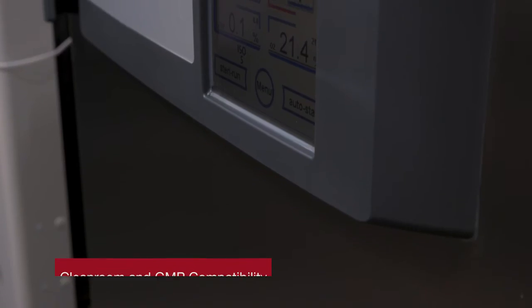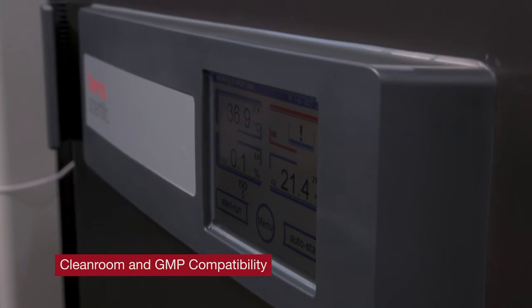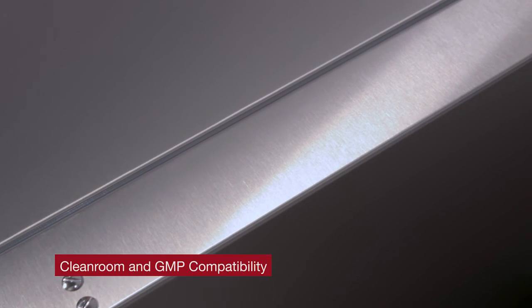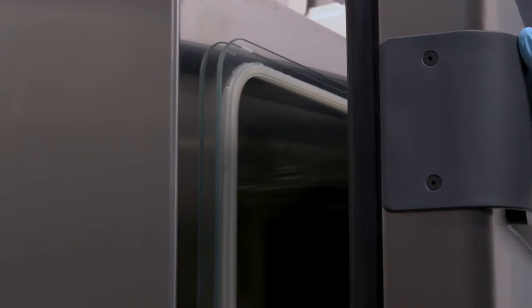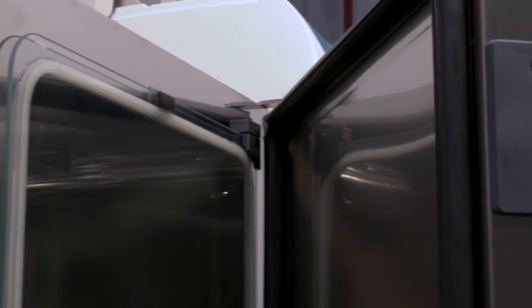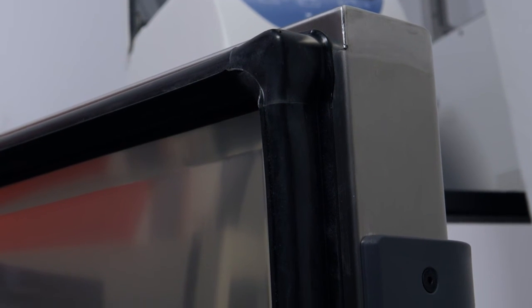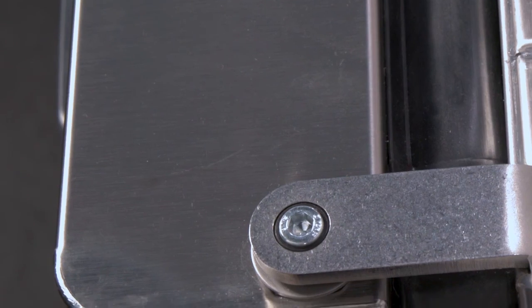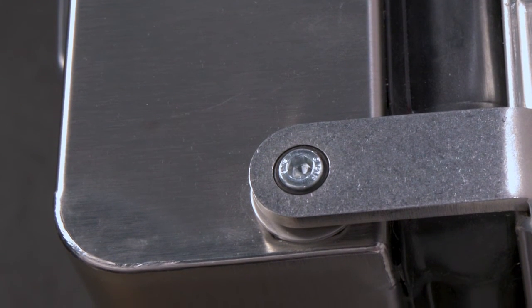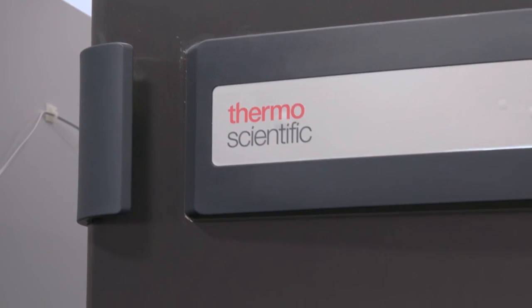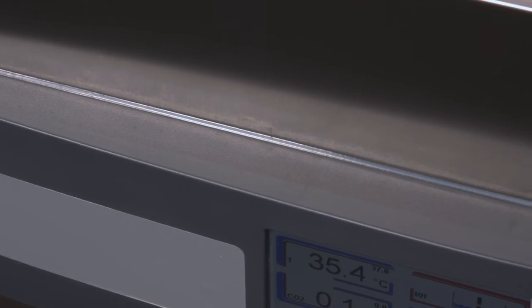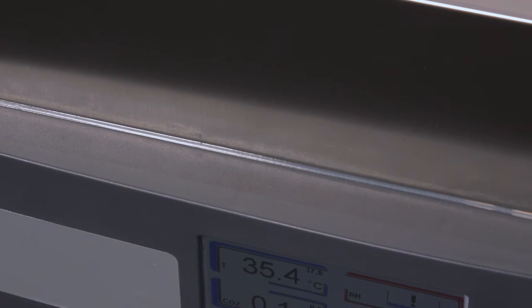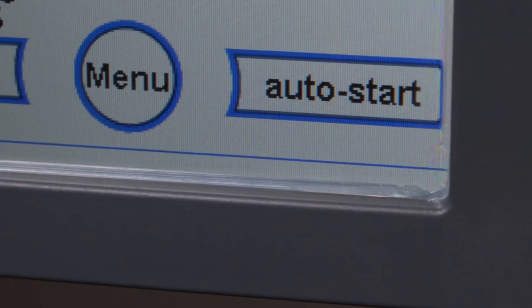But there are a lot of details here beyond the particle control system that we've paid very close attention to. First of all, the door is something that really needs close attention on how to make sure that it's compatible with this type of GMP setting. And so we've sealed the door completely with welded corners, and the entire unit, including the front door, has a brushed stainless steel finish.